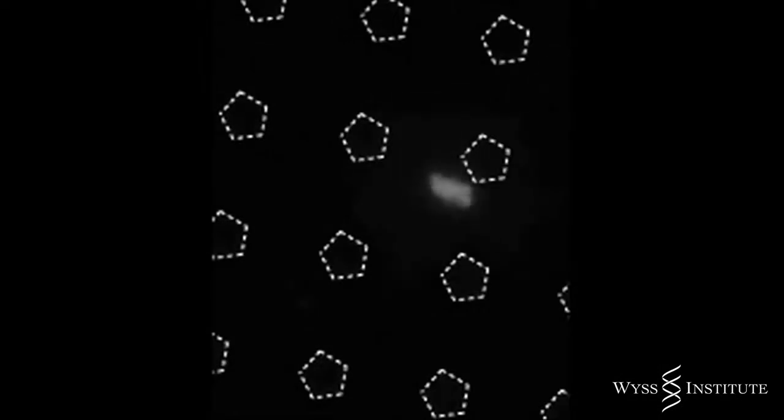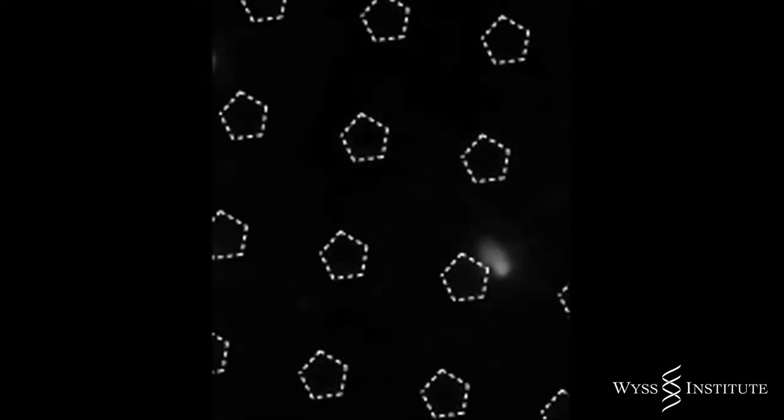Here's a magnified view showing a migrating white blood cell, making its way through the first capillary cell layer, wriggling through the pentagonal hole in the flexible membrane, and then moving out of focus to the other side.